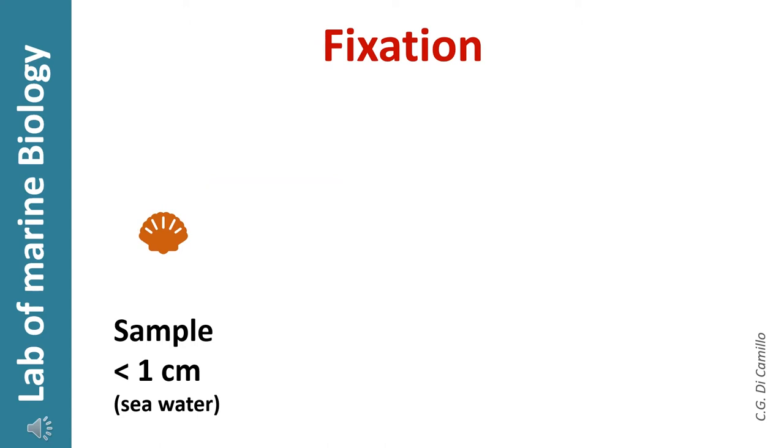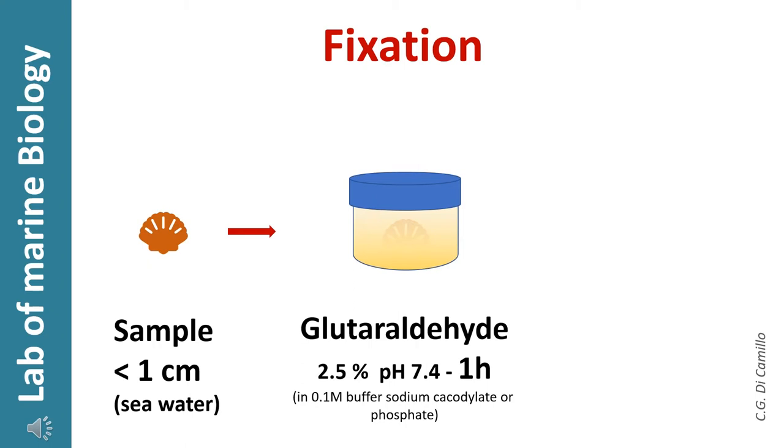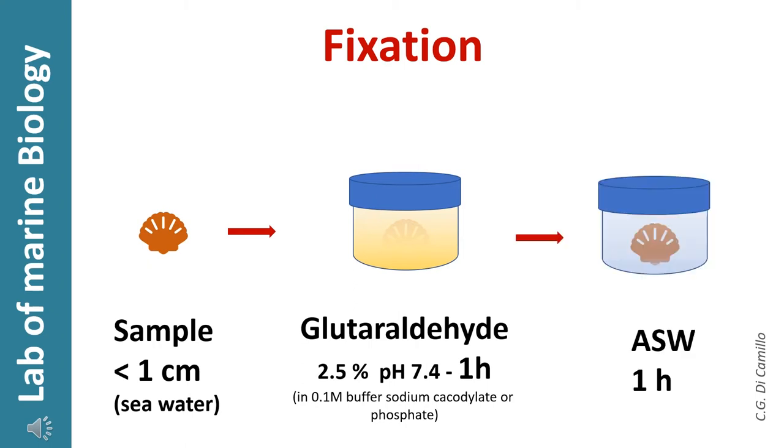There are several procedures to preserve biological samples. In order to observe the ultrastructure of marine invertebrates, you could keep the samples in buffered glutaraldehyde for 1 hour. Then, rinse the samples with artificial seawater. Remember to follow safe laboratory practices and procedures to handle reagents and lab tools.